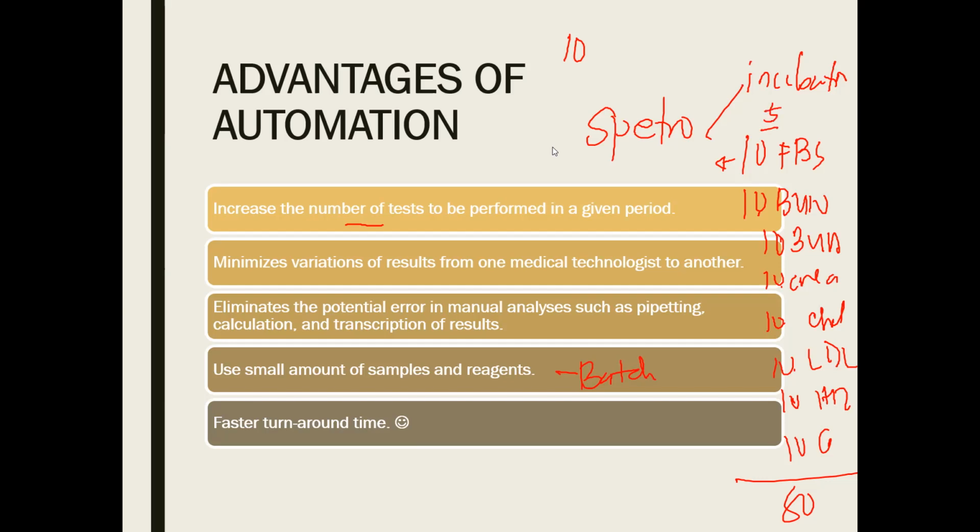O sabihin na natin 5 minutes lang ang isang incubation period. Before you can perform, no? Dito pa lang 10 FBS na to, it will take you 50 minutes. 5 minutes times 10. Hindi pala. Yeah, 50 minutes or almost 1 hour just waiting for the incubation period per sample.